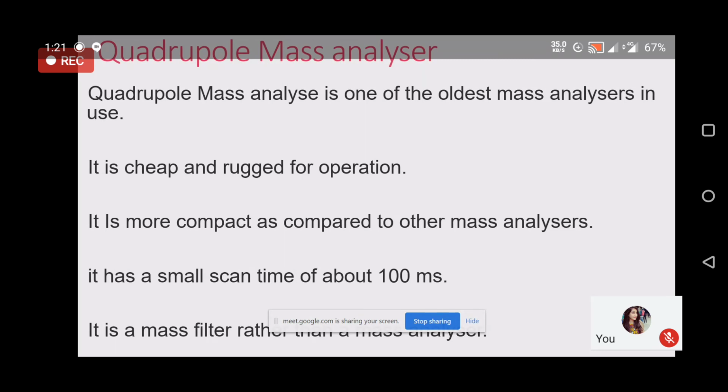I am not interested in one m/z. I am interested in the entire mass spectrum, suppose. Then what should I do? I'll come back to this point again, how the quadrupole mass analyzer is to be used. The quadrupole mass analyzer is extremely useful, provided you are interested only in one m/z value. Then it becomes extremely useful because it selects that and removes all others. Correct? But suppose I want to record the entire mass spectrum with different m/z values. How will it be possible is my question.